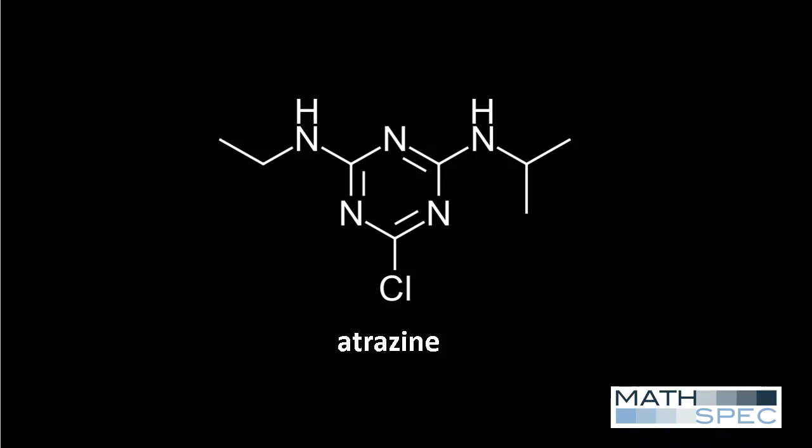In this video, I'll demonstrate how our Excel add-in can help identify an unknown compound from its accurate mass fragmentation data. This unknown compound is a derivative of atrazine. The data used in this demo is not from an authentic sample or an isolated metabolite, but you will see later that my proposed structure based on our rational numbers Excel add-in is probably correct.